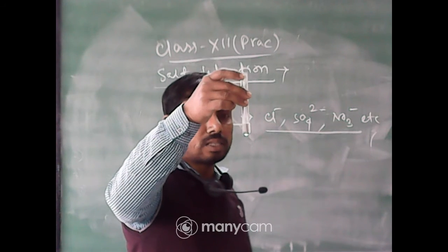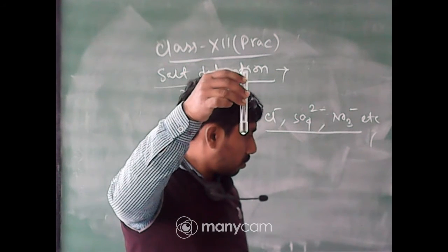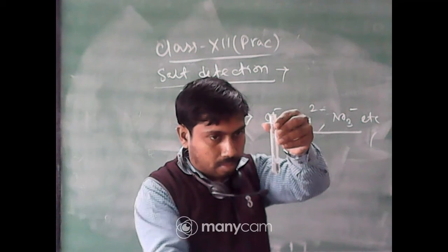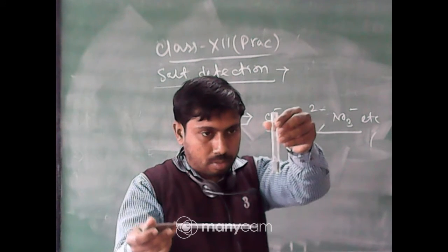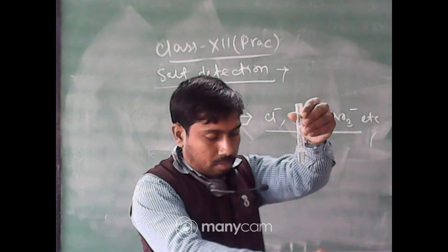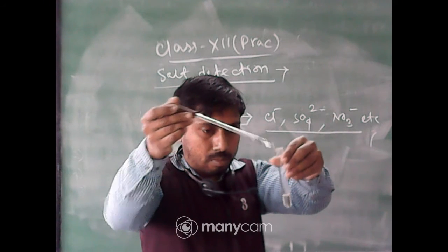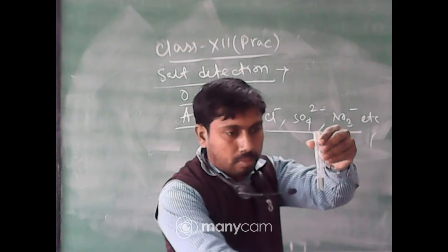Now a brownish color just appears. Now you have to wait.